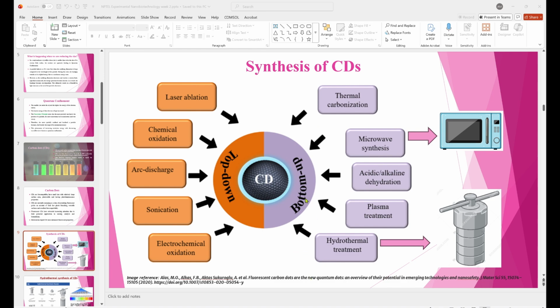First you have to take this synthesis reactor. This is the body. Then you have to put the hydrothermal synthesis reactor disk at the bottom. Then you place your hydrothermal synthesis reactor chamber body. You put your sample in it. You put the cap. Then again you put the synthesis reactor disk on top. Then you tighten the lid with the rod. Okay.